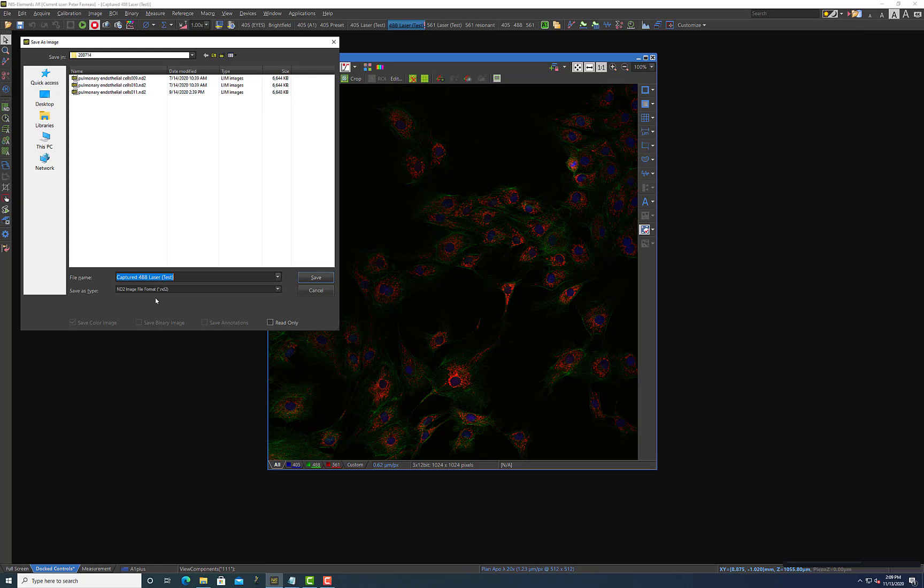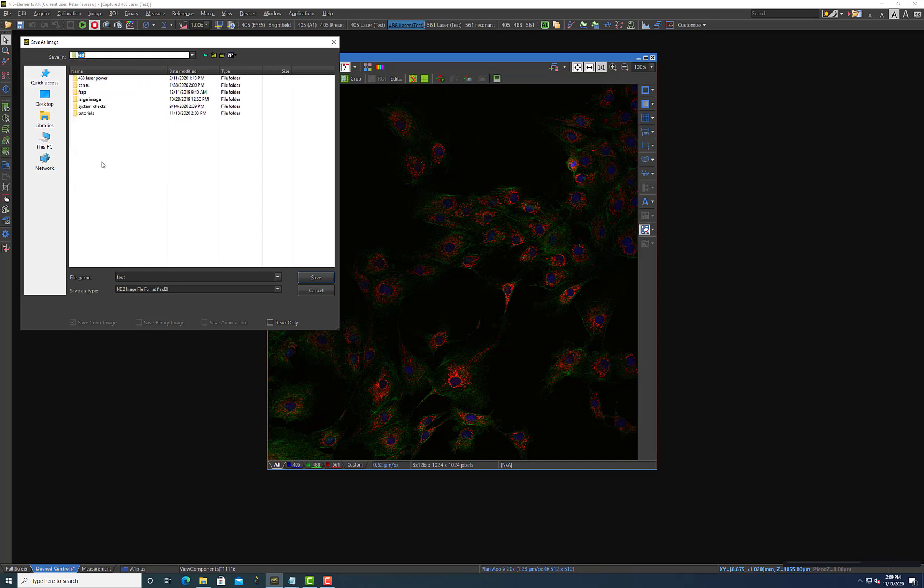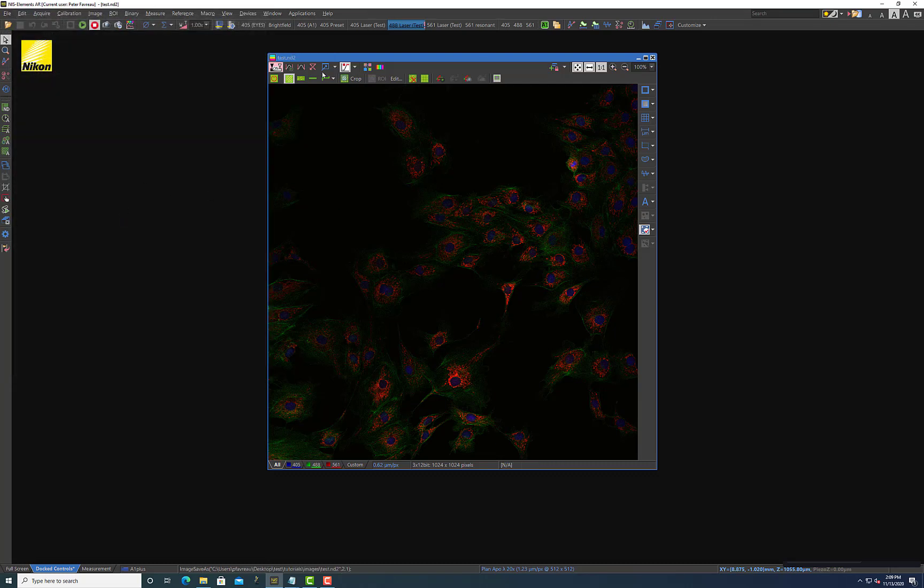So I'm just going to call this test and I'm going to save that to my folder. So I'll just save it there and now you see all these options are here. You can modify these if you'd like but typically I'll just say okay. And now it will save it as an ND2 file and I can just drag and drop it into elements and it'll load it exactly as you see here.